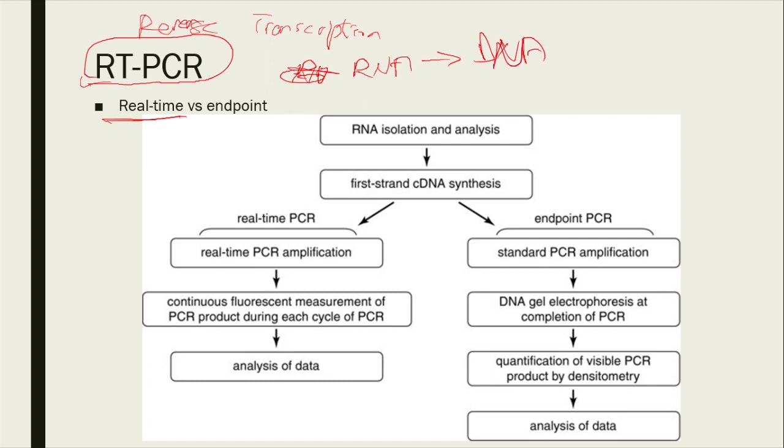And real time, it's real time. Basically you're knowing what is happening. And then there is an endpoint. So at the end, we're looking everything together. The steps are very similar. So here we have RNA isolations and analysis, making first strands of cDNA.